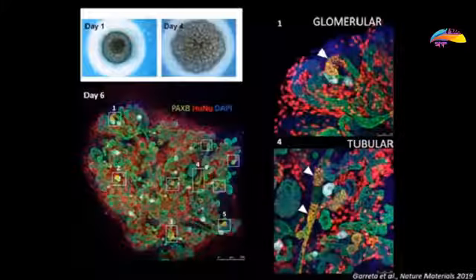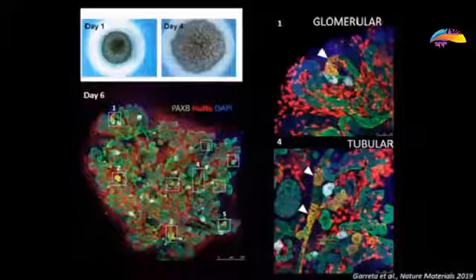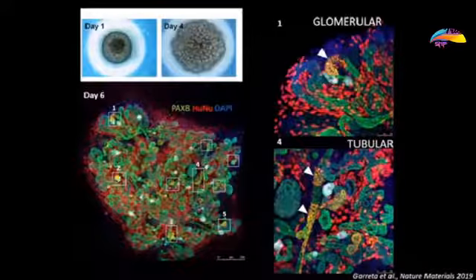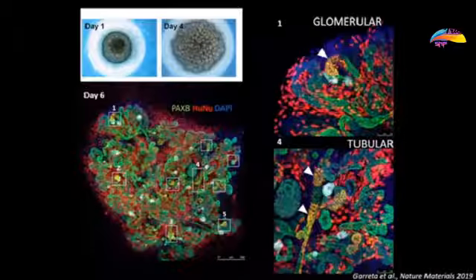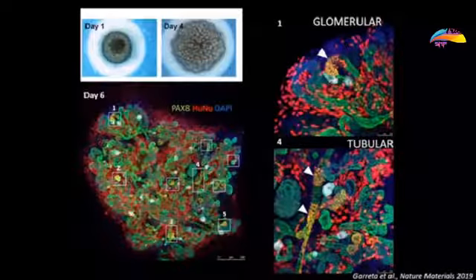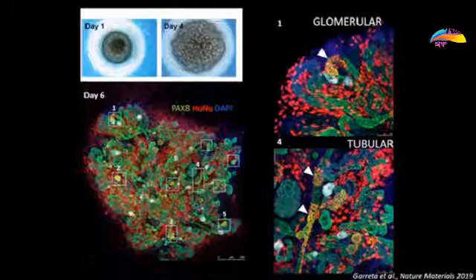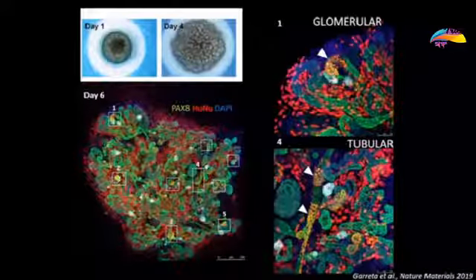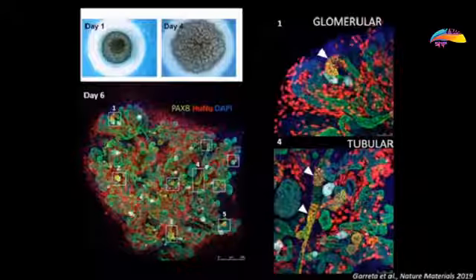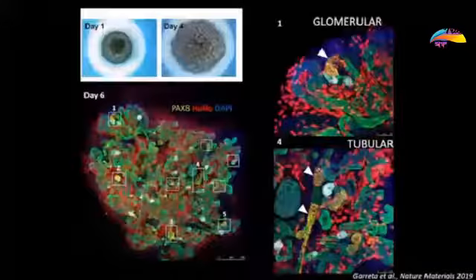Then, in order to further test the potential of our progenitor cells, we took advantage again of the reaggregation assay by assembling day 5 nephron progenitor cells together with mouse embryonic kidneys. And we can see here in red cells stained for the human nuclear antibody.